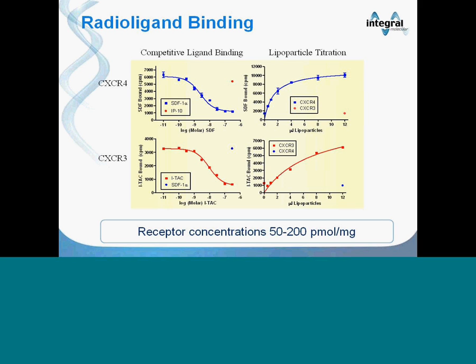Unfortunately, I logged in late and didn't see the early slides where you're making the lipoparticles. If you still have time, could you go back and quickly review those slides? Sure. So I'll review. Can you see the slide? Yes. Okay. So lipoparticles are produced in cells.